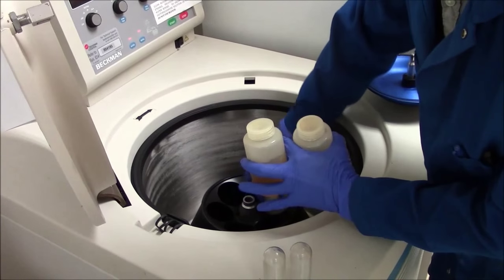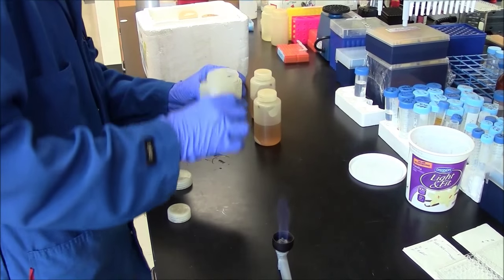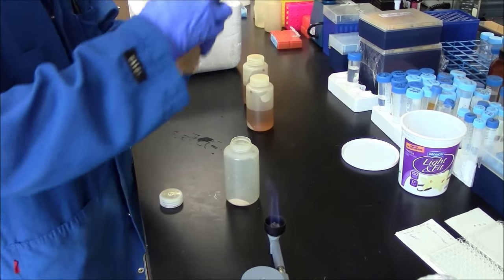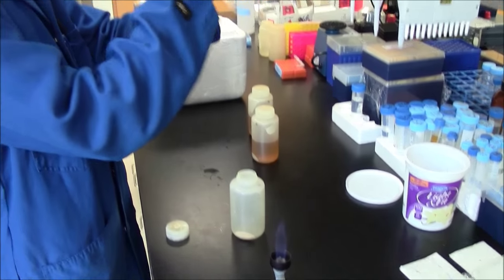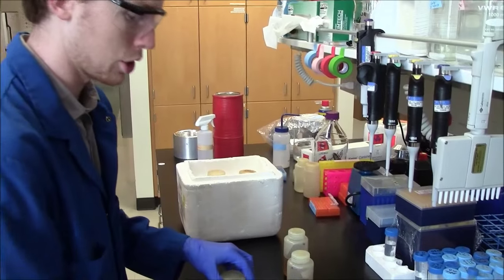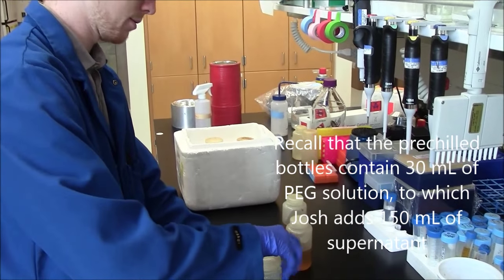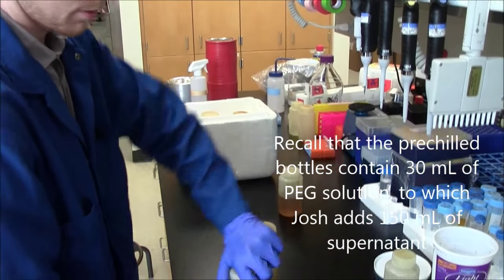The 10-minute spin is complete, and we're removing the bottles from the centrifuge. You can see there's a cell pellet. The cells are trash. The supernatant contains the phage. So here, Josh is pouring the supernatant from the original centrifuge bottle into the pre-chilled bottles that contain the PEG solution.